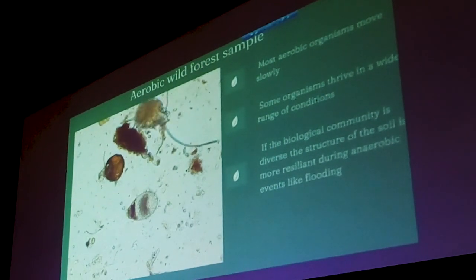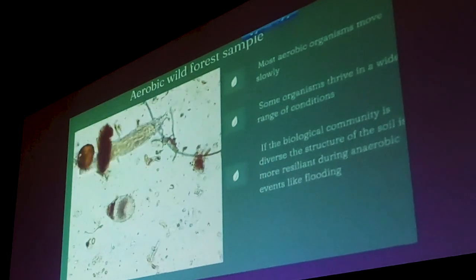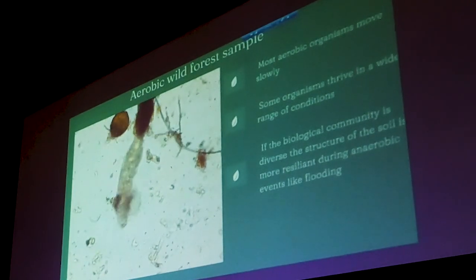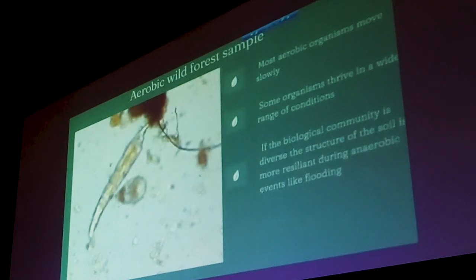But while I was trying to get the film of these beautiful testate amoeba, this rotifer comes in. And you can see the rotifer woke up because suddenly there's food. We're in a healthy forest system. There's diversity in our aerobes, and there's diversity in our anaerobes.